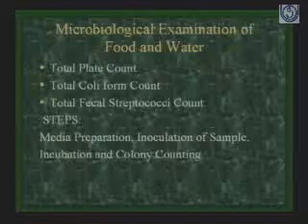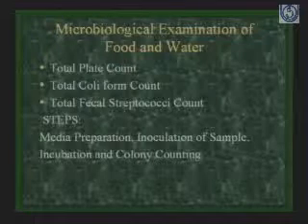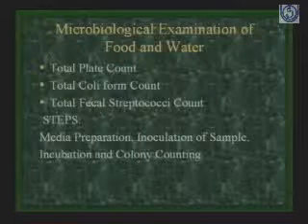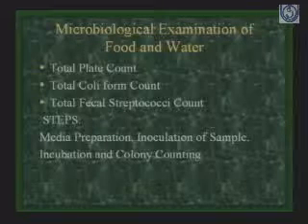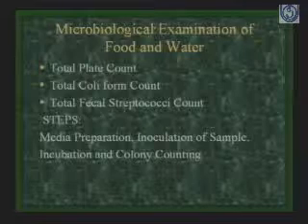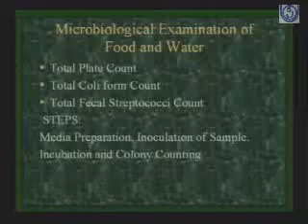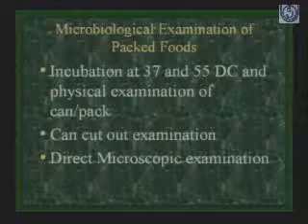Media preparation, because as I mentioned, these microorganisms cannot be seen by the naked eye, so we have to give them food to grow into a colony. Colony means the number of the units, and that is called colony forming unit, CFU. And then after a particular incubation, you can find out how many colonies are there.